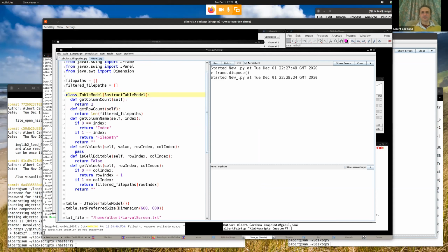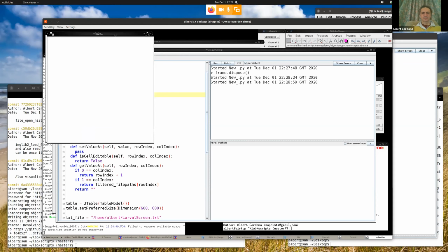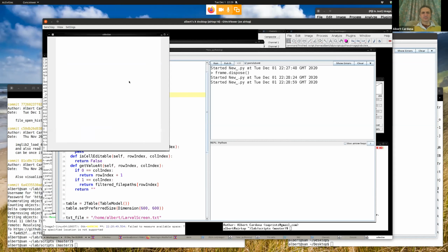Good. Now, let's stop making this persistent. Forget about that frame. Do it again. Okay. Why I don't see anything is a good question. Where is my table?